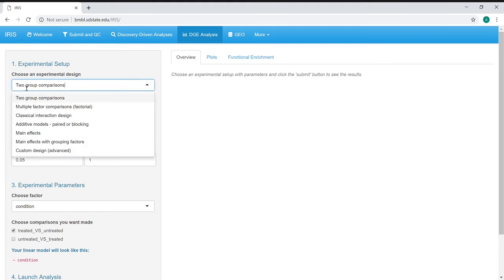We have a few different experimental design options here. The two group comparisons is the very basic level where you're comparing any of the two factor levels or any of the pairwise factor levels. We also have multiple factor comparisons, also referred to as a factorial design.